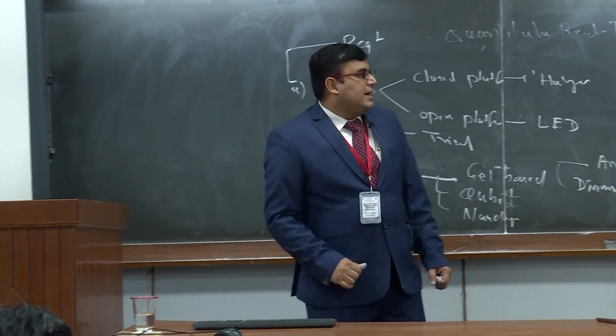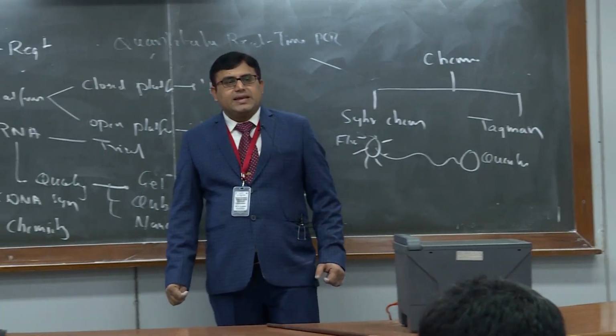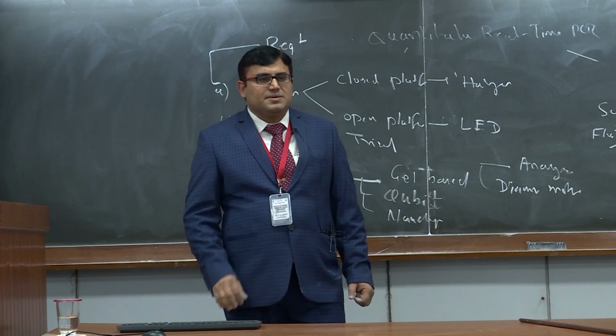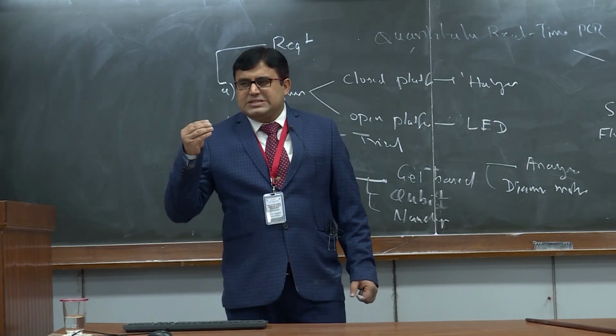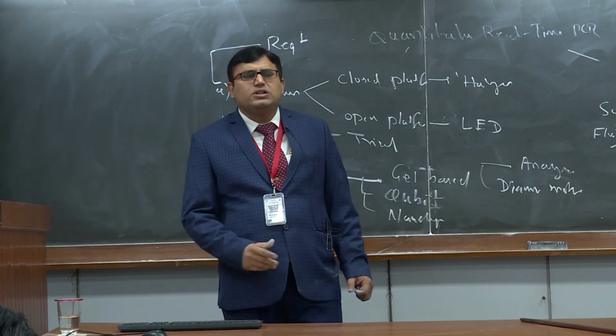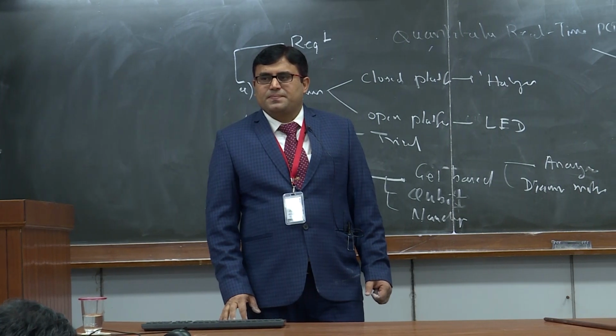And last, in developing countries like India, very few labs prefer TaqMan-based chemistry because of its tedious way and its cost. But SYBR, in almost all the labs, people are using for expression analysis.